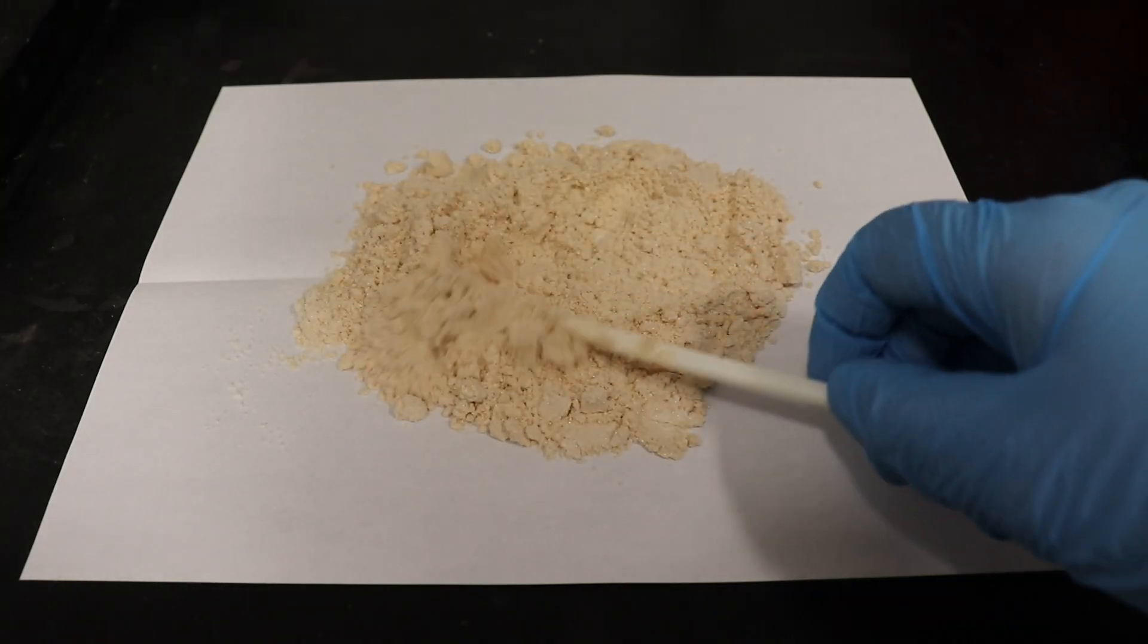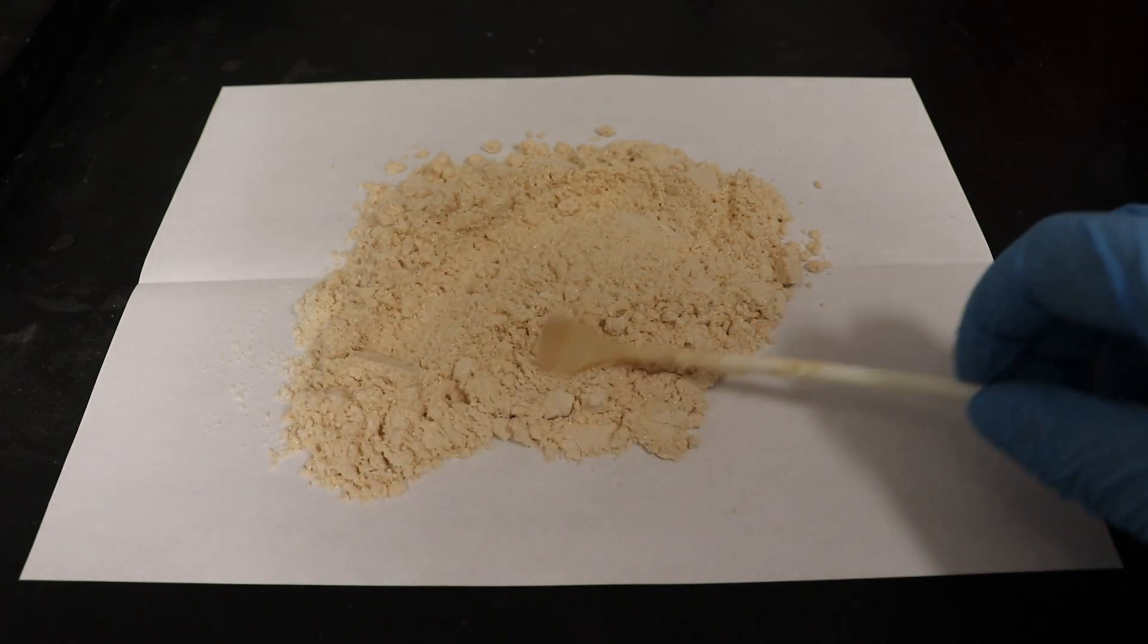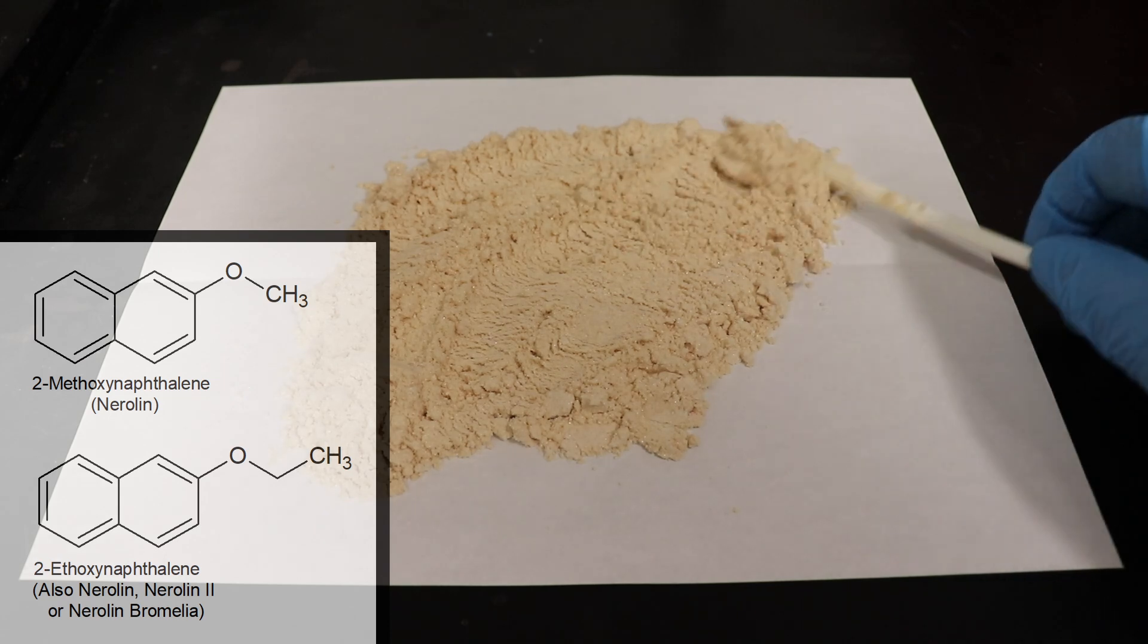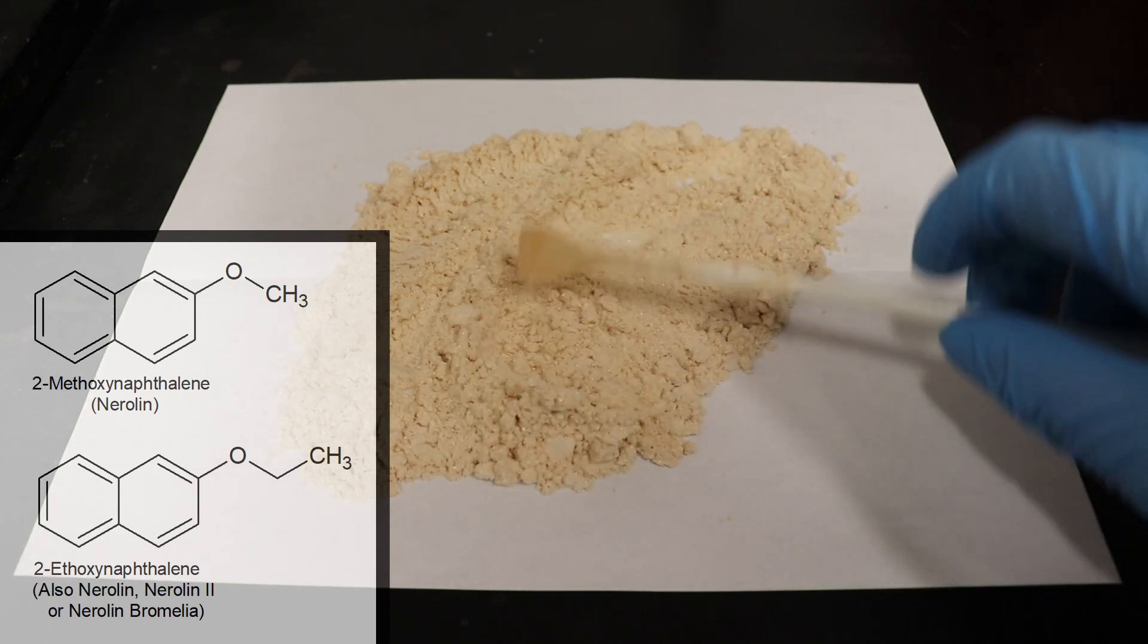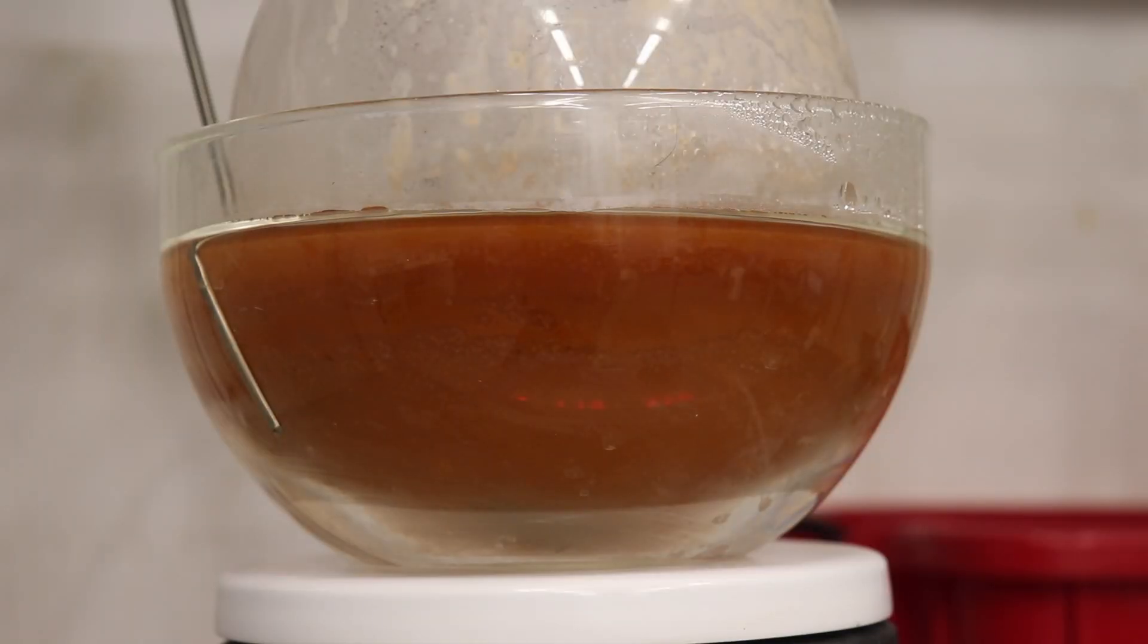2-methoxynaphthalene, also known as beta-napthol-methyl ether and methyl-2-napthyl ether, as well as nirlin, however both the ethyl and methyl-2-napthyl ethers seem to be referred to as nirlin. But regardless, it is a pleasant-smelling ether that finds use in perfumes, however I'm going to be using it as a building block in future organic syntheses.